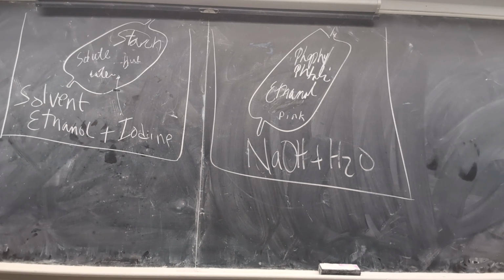Rinse out the beakers, all of the beakers, and make sure every group has a pipetter. So now we're preparing. So come pick a beaker, please. Each group, come and pick up a beaker. Rinse your beaker, and let's make a solvent.